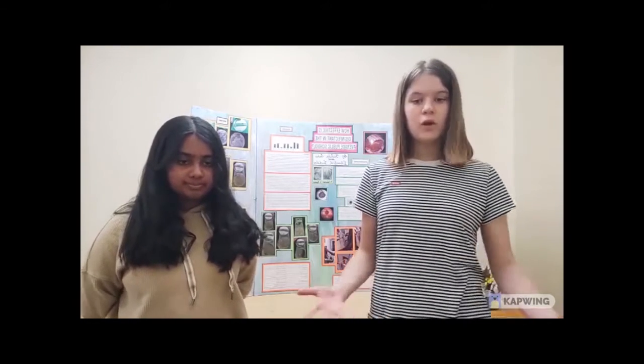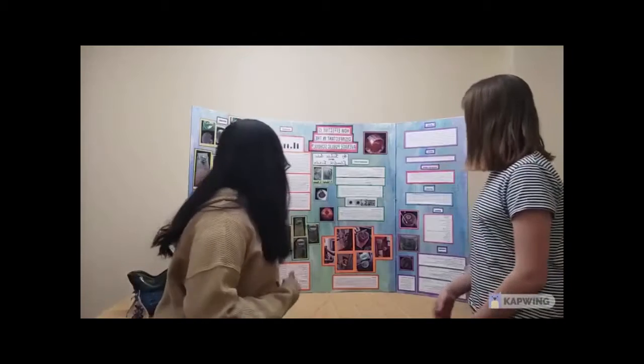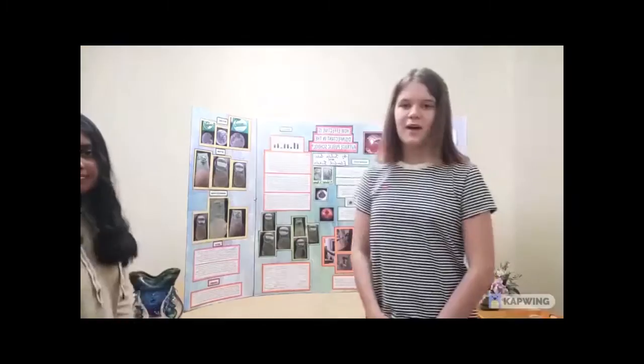After both incubations, we compared all of our results. We looked closer at all the samples with a microscope and saw all the growth. We learned that the Chromebook tested had the most bacteria and the water fountain button had the least bacteria, as seen right here.